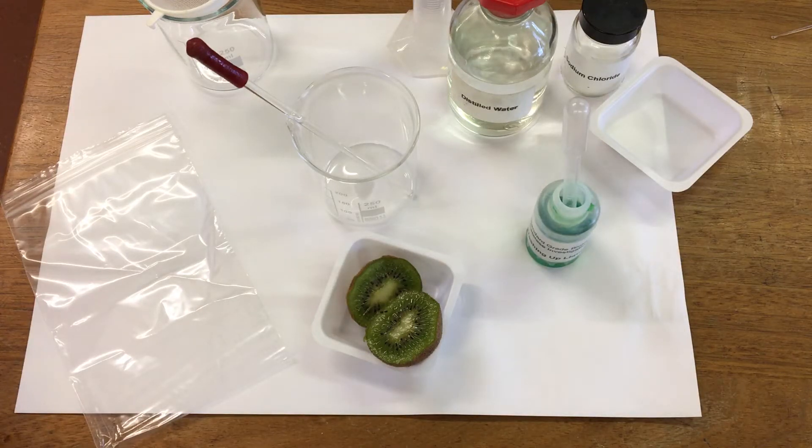In this experiment I'm going to do a DNA extraction. All living things have DNA in their cells and today we're going to use kiwifruit.